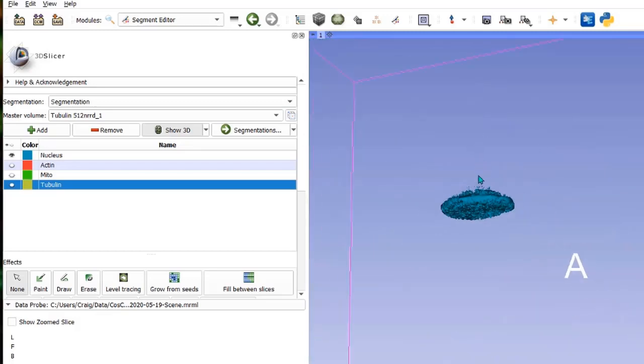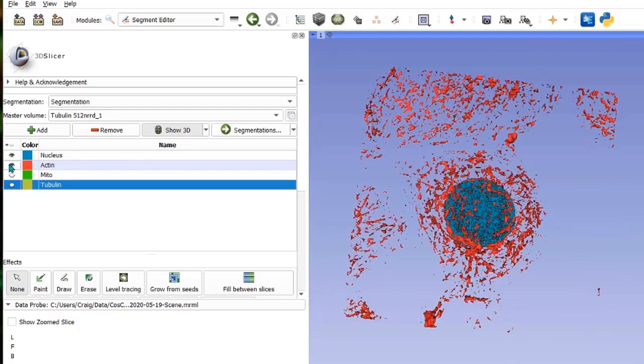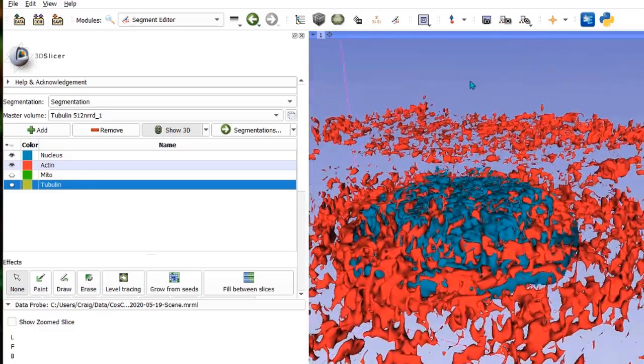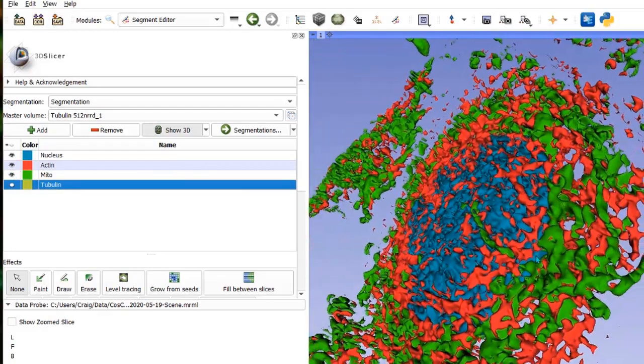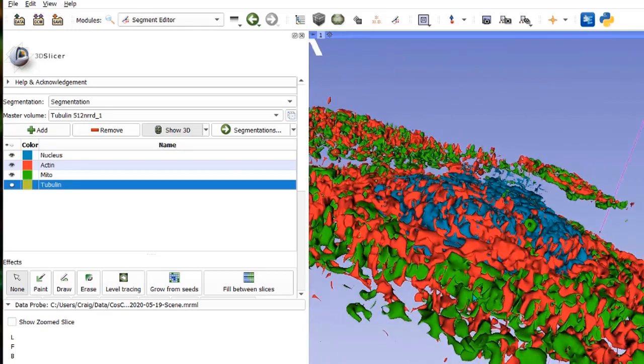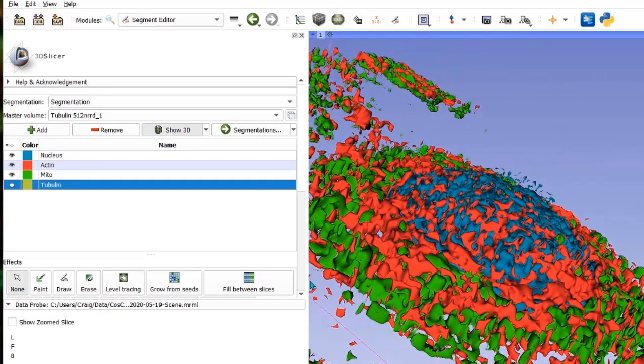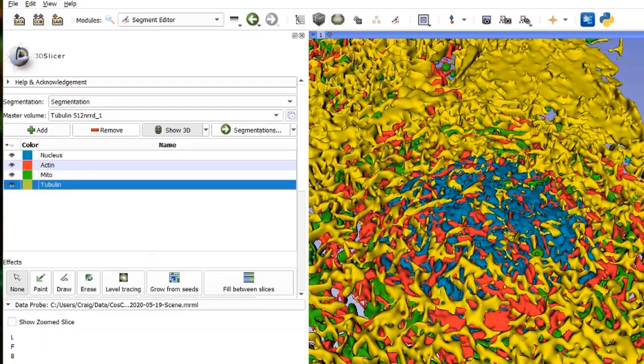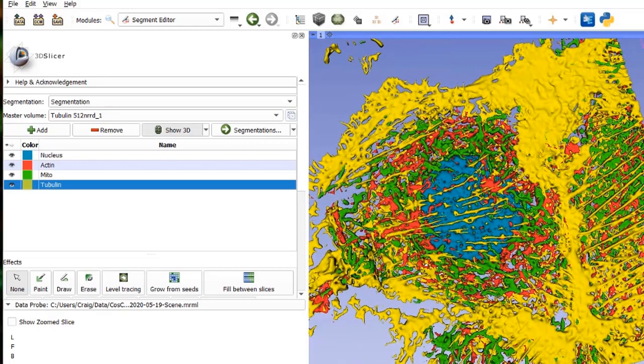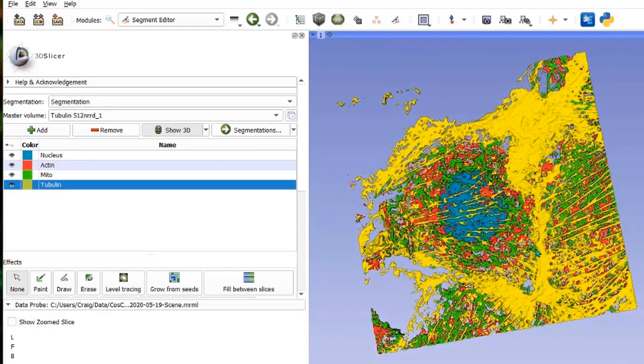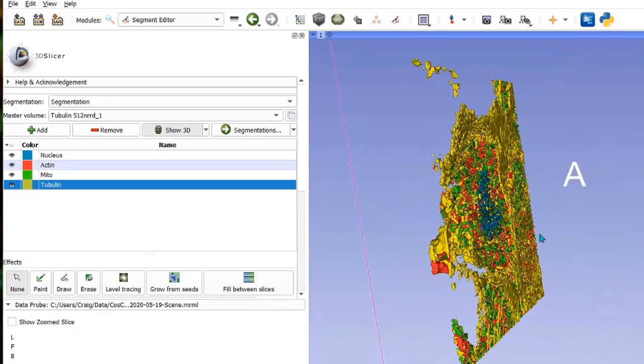Having already thresholded and segmented the other three channels, I can now bring them in one at a time. Here's the actin. We can see the mitochondria. And then finally the tubulin. I've got another tutorial on the channel called 3D Slicer Thresholding and Segmentation that details this part of the process. We can now export these segmentations to other packages.